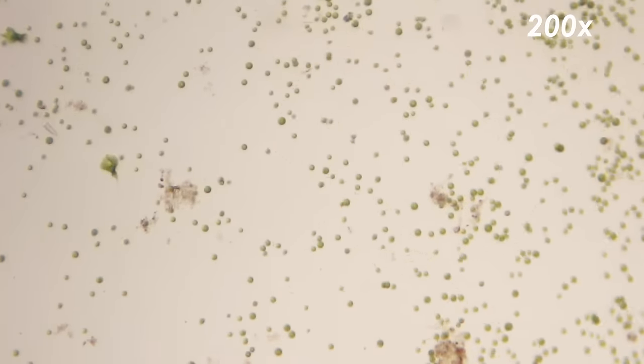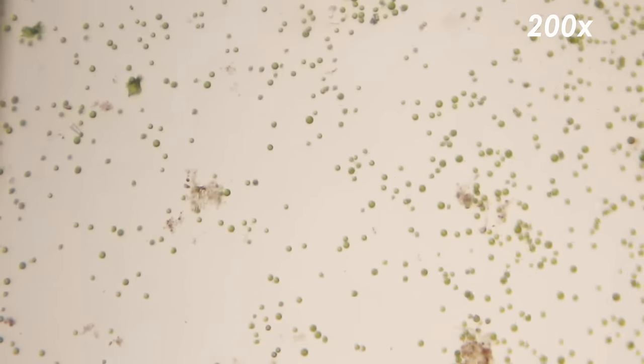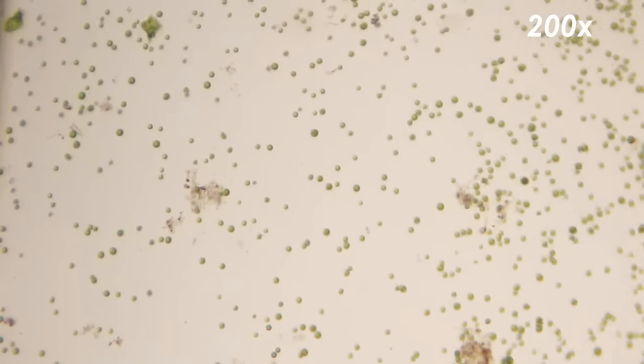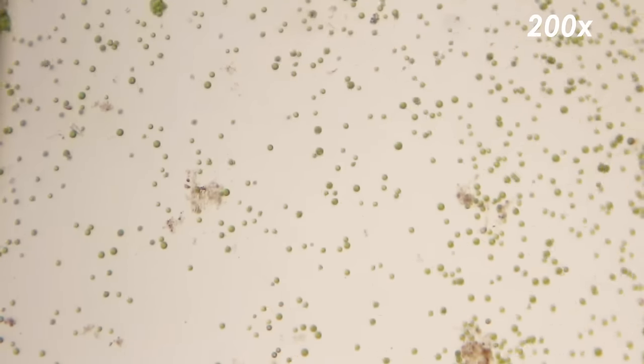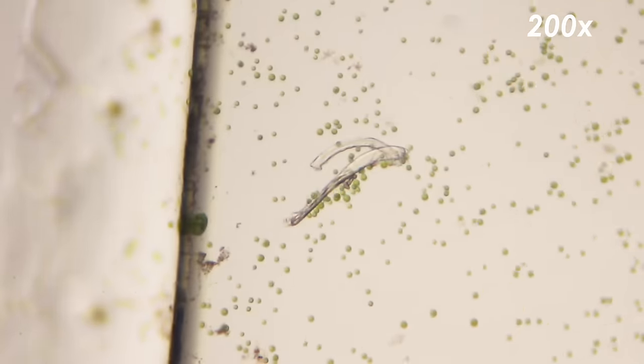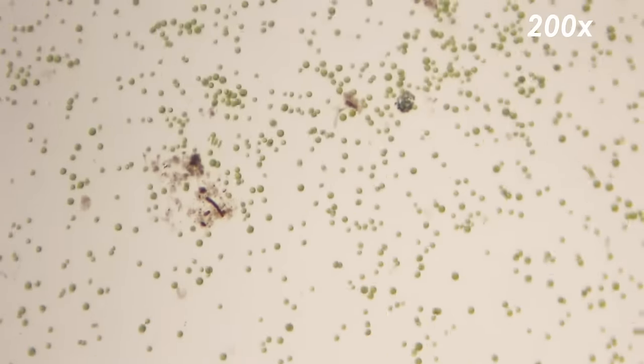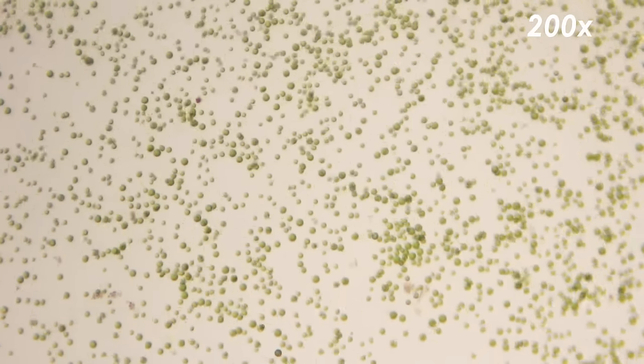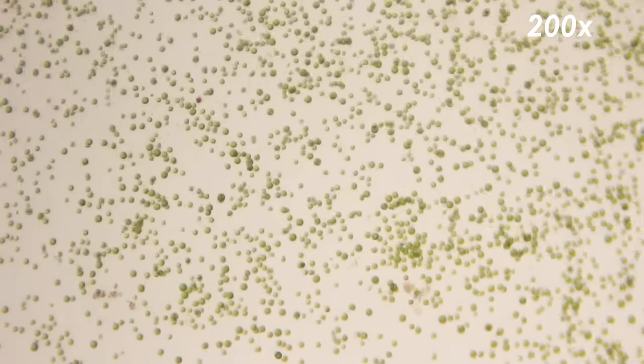So here's a high level view of the pond water and remember we're just taking a little drop of water to show you and this is just amazing how much microorganism life is here. You can see the Phacus longicauda there on the left and then all these little Chlamydomonas which are single cell green algae that are just bouncing all over the place. And then it looks like there's some decaying matter in there also. And it's just amazing how excited these green algae are.